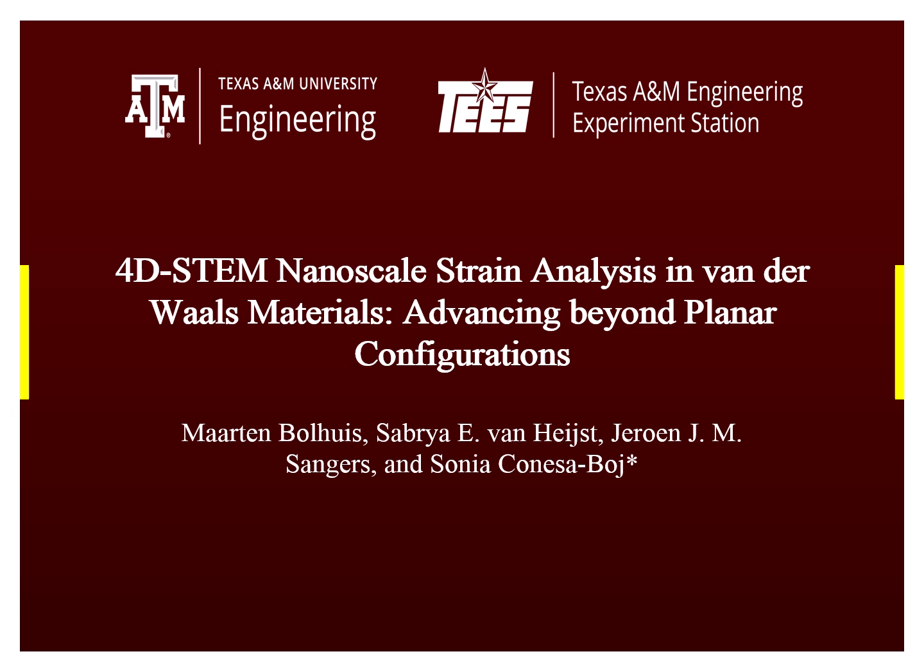Good morning, everyone. Today I'm excited to present this work on 4D-STEM nanoscale strain analysis in van der Waals material beyond planar configuration, which uses advanced 4D-STEM imaging combined with machine learning technique, specifically focusing on the exit wave power cepstrum method.